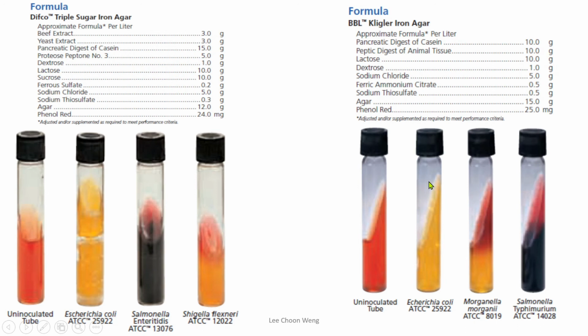So for here, you know for certain it is a lactose fermenter. This is only a glucose fermenter. And this is a glucose-only fermenter and also H2S producer.